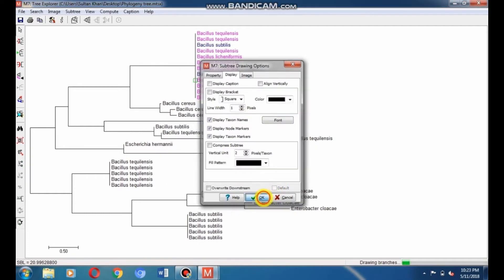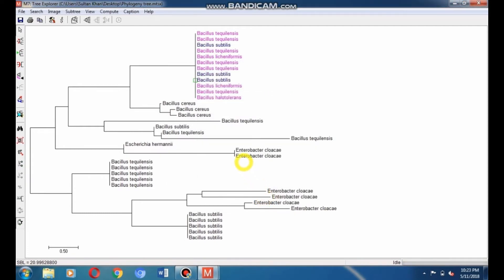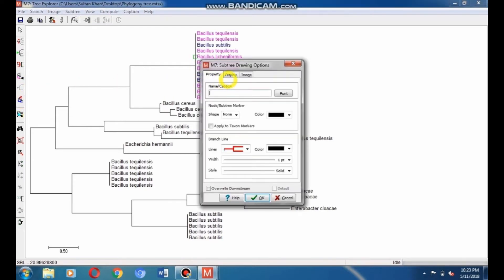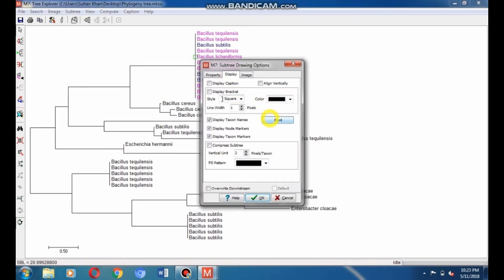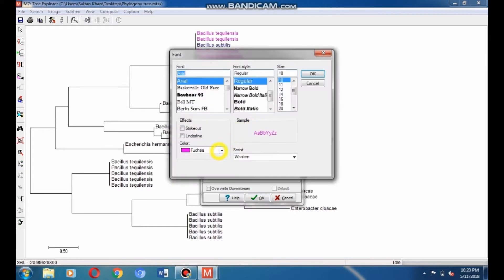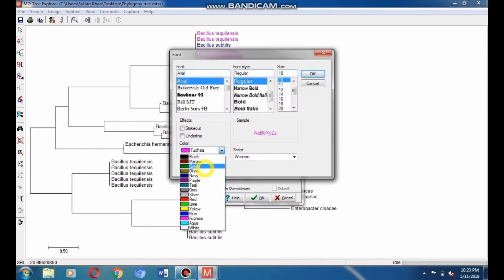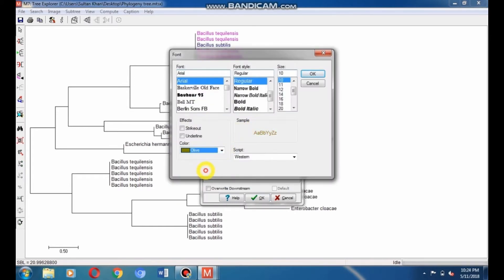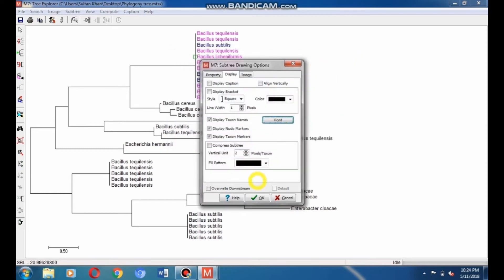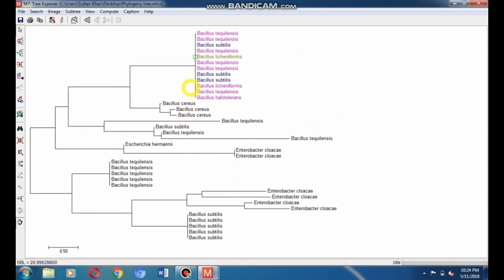Now select the licheniformis species and change its color to olive. Go to subtree drawing option and select olive font color, then click OK to apply it. Here you can see the licheniformis. Like this, give olive color to other licheniformis species by putting the cursor in front of it. Go to subtree drawing, go to Font, and change the font color to olive.